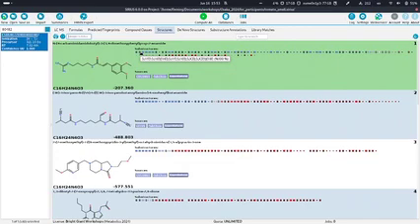Very similar, but not the same: when we did subclass or level 5, the assignment was not the same. It should be the same on exactly the same data, at least in SIRIUS 5 and SIRIUS 6, of course, unless new versions or the predictor changed. But if you process this exact same spectrum, it's a deterministic process, it should be the same.